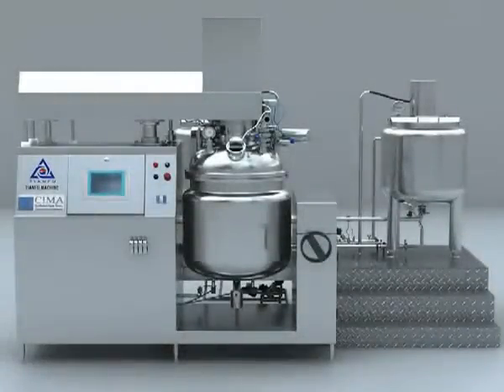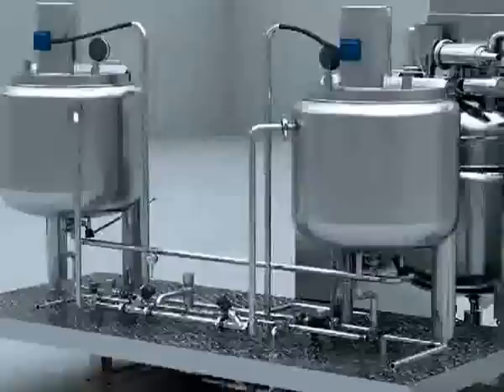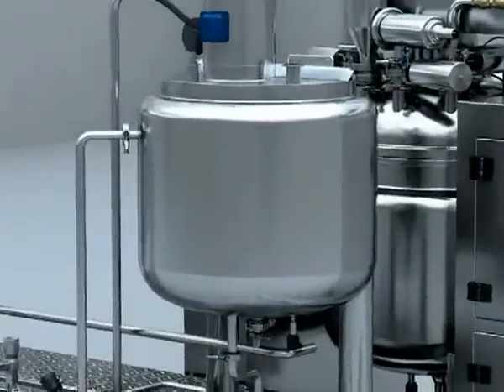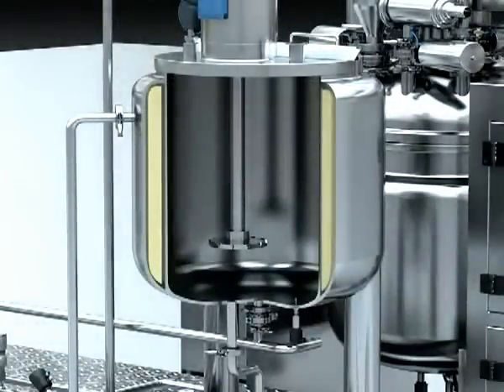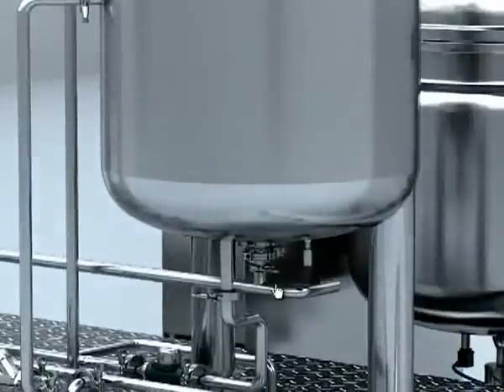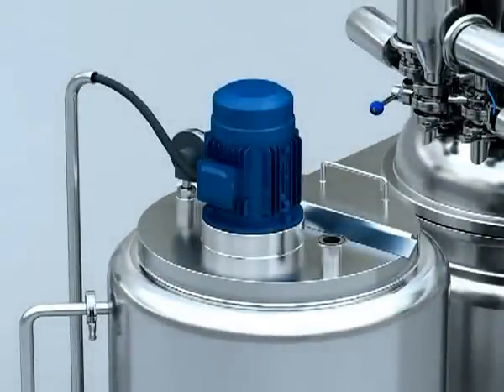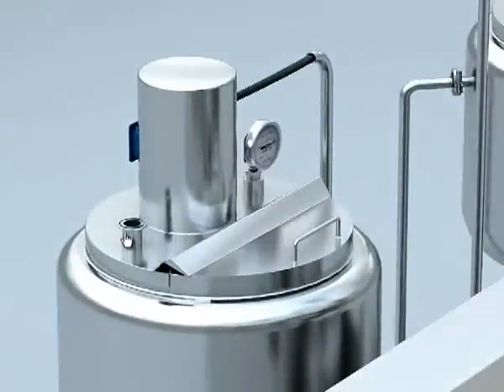5. Blending system. It is made up of a working platform, oil tank, and water tank. The structure of the oil tank and water tank is made of three layers: upper half open lid, and bottom ceiling head. The bottom ceiling head is connected with the flange type tank and the thermal protective layer adopts PU form technique. Other components are a wave wheel mixing device in the tank, discharge valve and temperature sensor at the bottom of the tank, half open lid, and mixing motor.